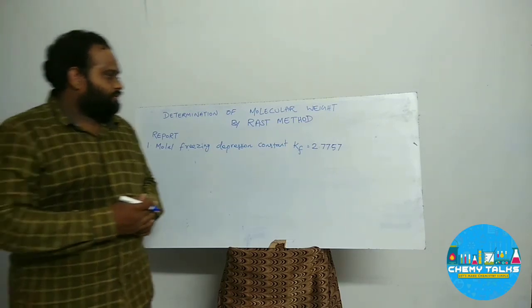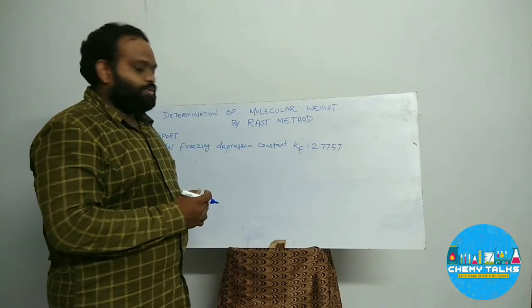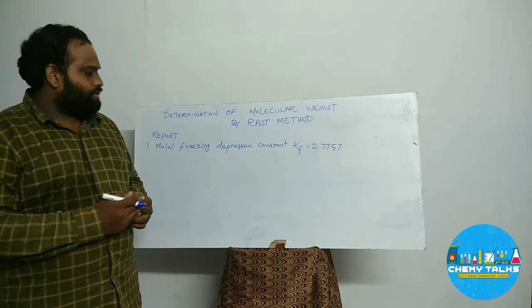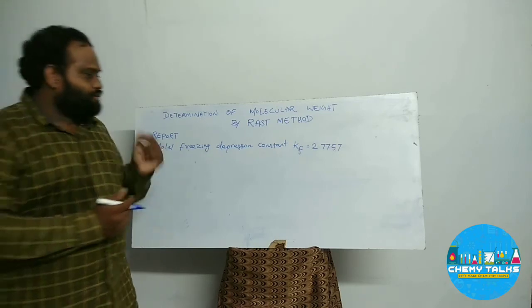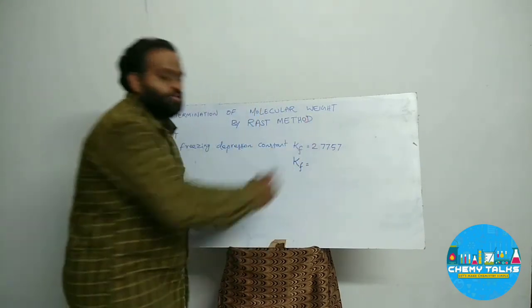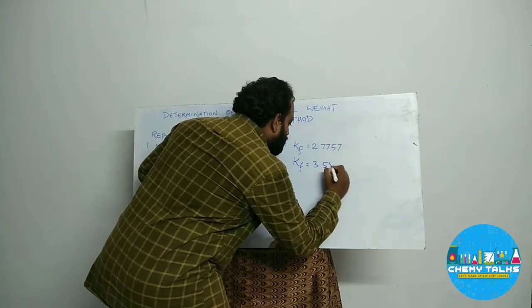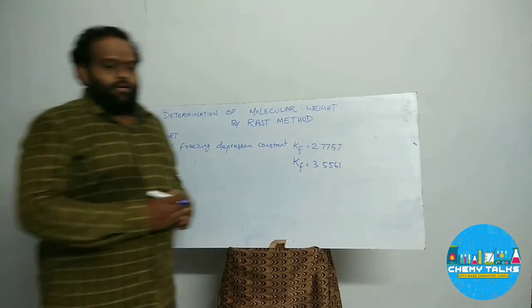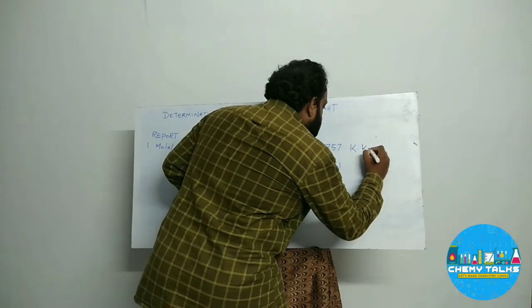After determination of this value, 0.3 gram of solute is added to that mixture. It gives another Kf value, that is Kf is equal to 3.5561.